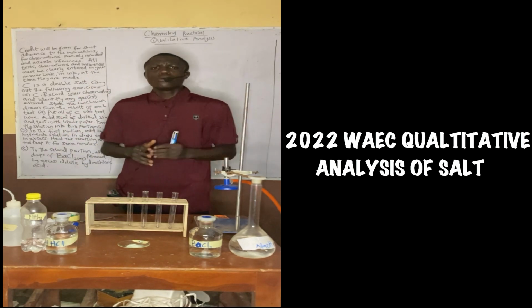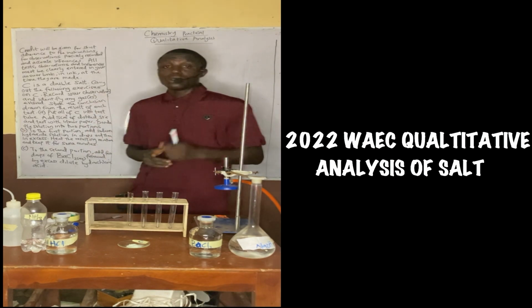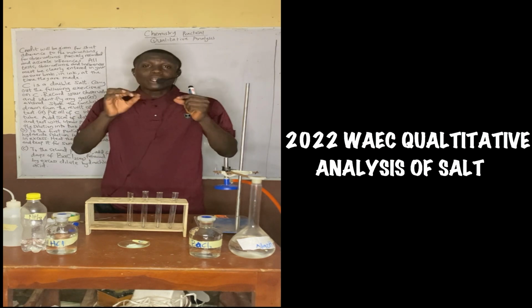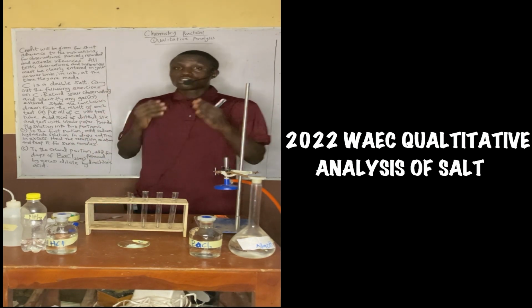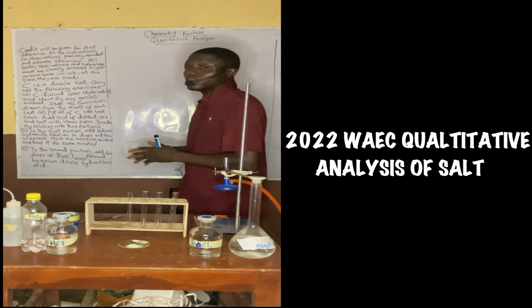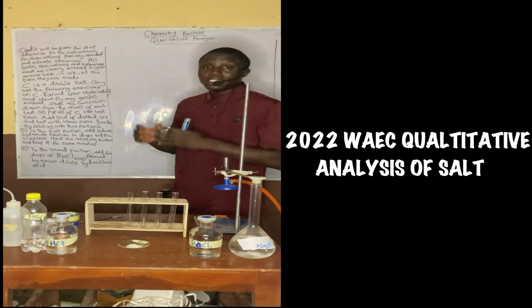Today I will consider the 2022 chemistry practical, particularly question number 2, which is based on qualitative analysis. This question is based on salt analysis, and it is a likely question to be asked based on the reagent given to us this year.